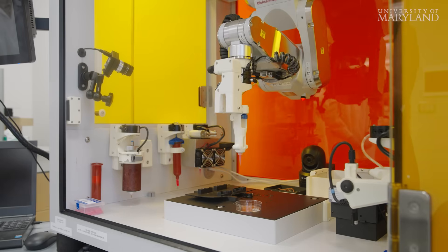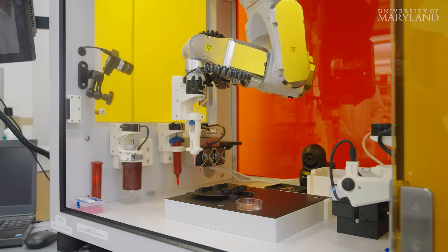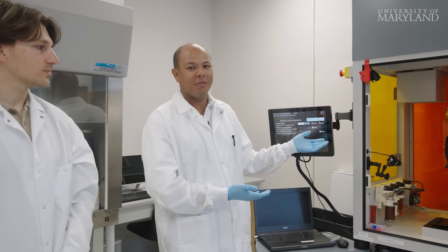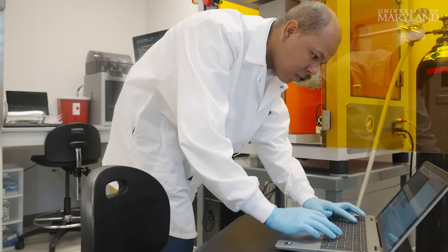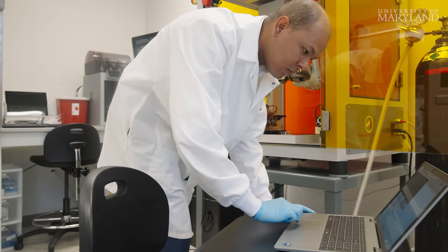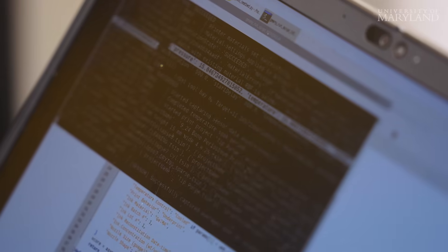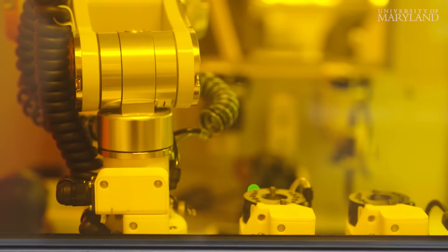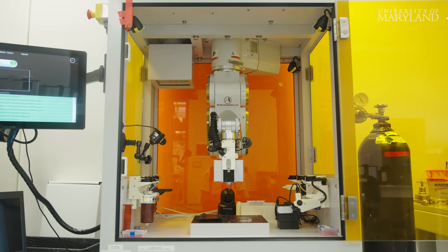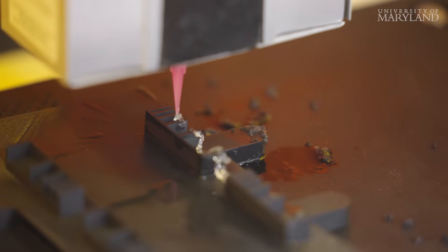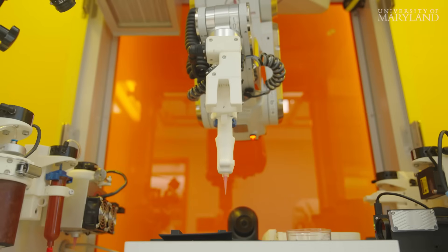We realized that AI could be applied to rapidly increase the speed at which we could do investigations. This is the Bio Assembly Bot 400. In order to build any AI that performs well, you need a lot of data. We've been generating a large training data set to train our AI models, printing under various print conditions — for example, different printer pressures or temperatures — as well as different environmental conditions.